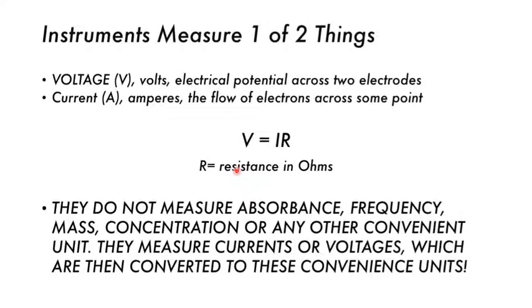Oh, okay. So in a balance, I don't know exactly how a mass balance works, but whenever we measure the mass, inside there's like a little arm which moves up and down, which kind of connects the circuit more or less, and that arm moves depending on the amount of mass that we put on the balance. Oh, I'm not very good at explaining this.